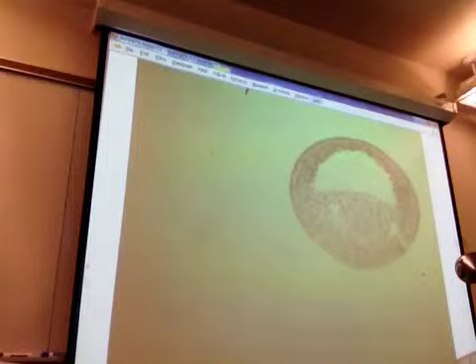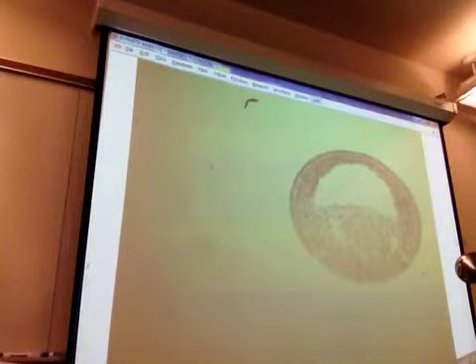What's that? That is a follicle. Nope. That is a blastocyst. This is actually frog. What are these cells? The ICM, or inner cell mass. What are these guys? Blastomeres. Good. Trophoblast. What's a blastomere? Is that the cells that form up the blastocyst?